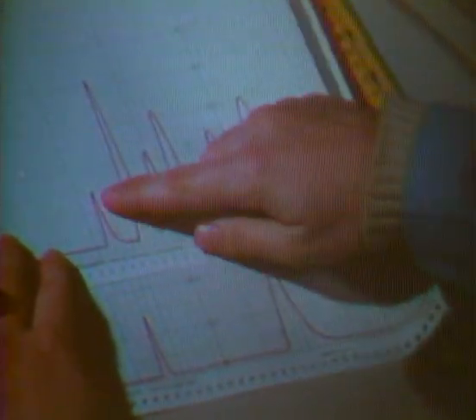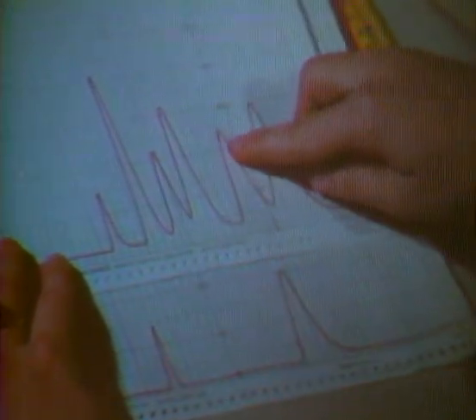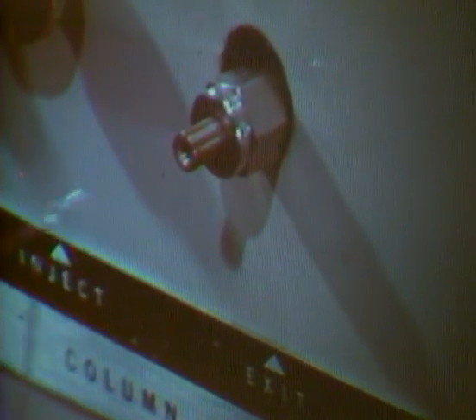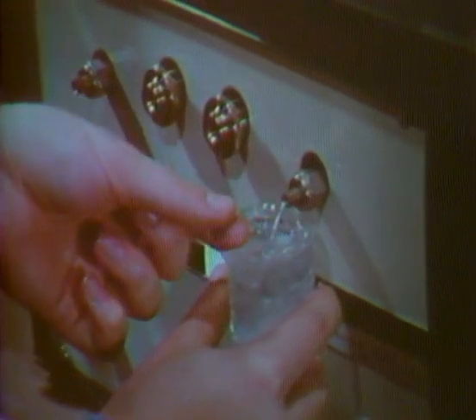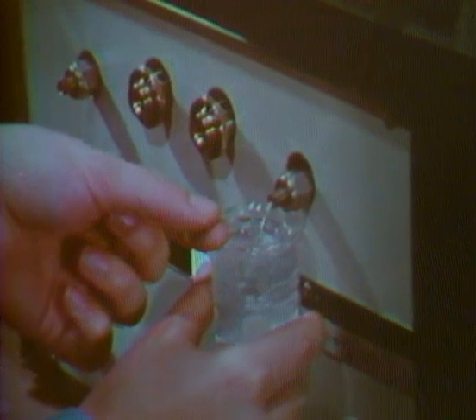If components have identical or very similar partition coefficients, peaks may be difficult to identify from relative retention data. For absolute identification, the substance emerging from the column should be trapped and transferred to another analytical instrument. For example, an infrared spectrophotometer or a mass spectrometer.